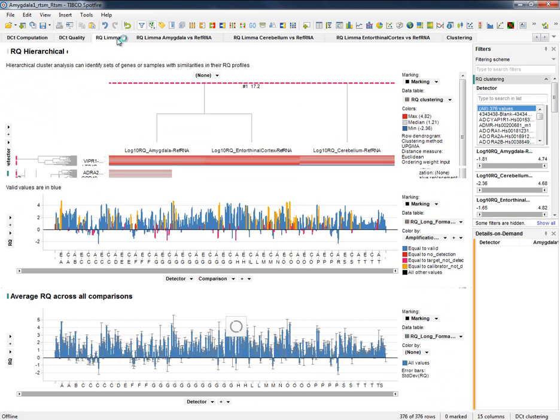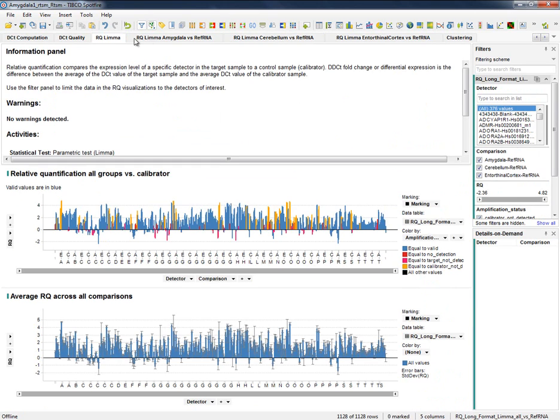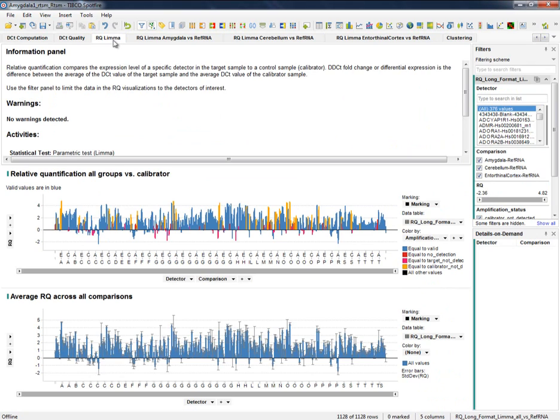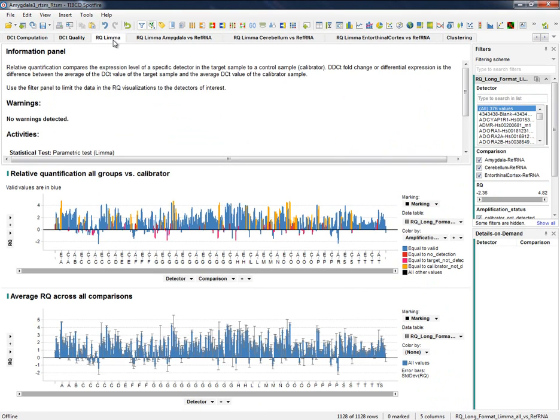Regarding differential expression results, we first have a report where we can inspect how the detectors behave along all the conditions. For instance, in our example, the RQ of every detector along each tissue when it is compared with the control group.